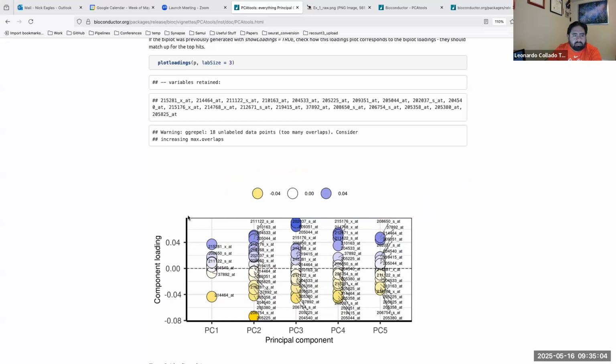So actually, do we have a use case for these groupings, like doing a GO analysis, or is it all kind of abstract in terms of top genes? Is there anything we can pull out that's biologically relevant, or is it just to better understand the PCs? I'm not sure, because this would be mostly talking about variation, the amount of variance, important genes, not necessarily what their function is or why they're important.